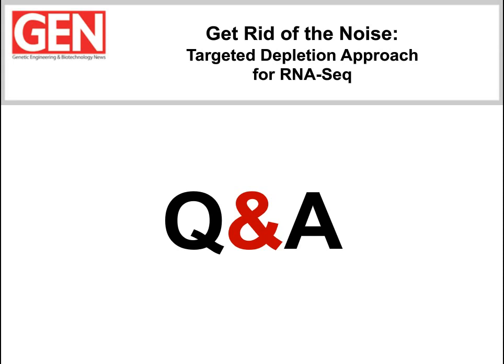All right, thank you very much. Maureen, we have a question for you. What are the standard QC steps in validating success in generating a Solo library?